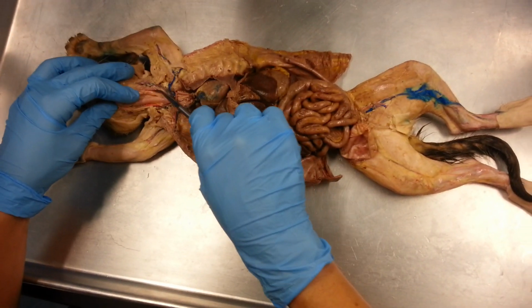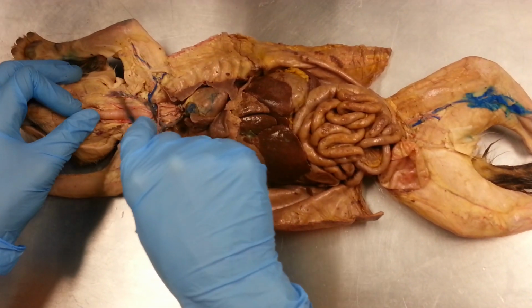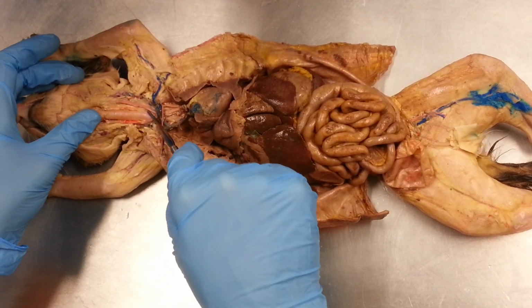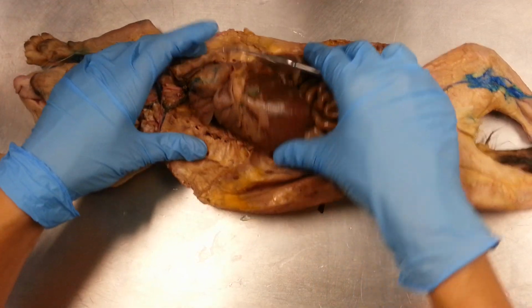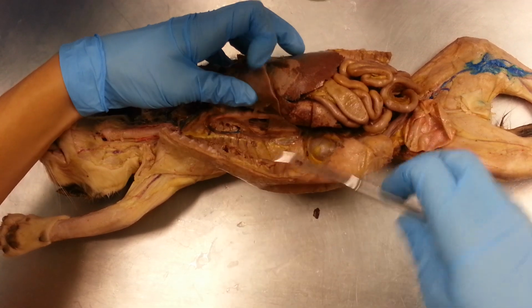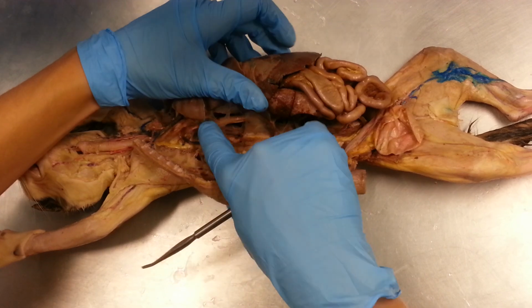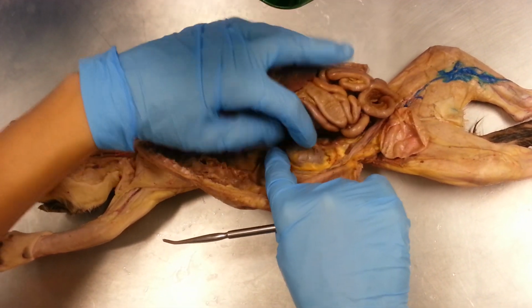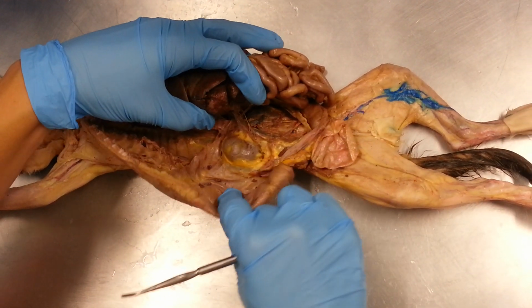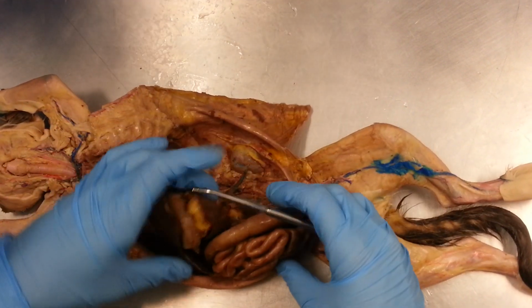Okay, going up from that, we've got our carotid artery and our jugular vein. That's all I need to know for the neck. Carotid artery, jugular vein. Okay, let's move down towards the abdomen. I can follow that azygous vein down here, and I can follow my thoracic aorta into my abdomen. Once I've passed my diaphragm, it becomes abdominal. Okay, my descending aorta is abdominal once I've passed my diaphragm.